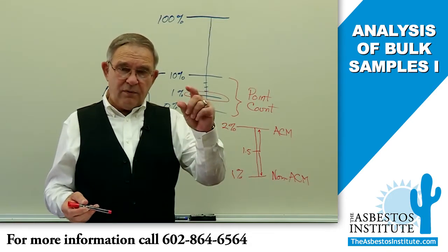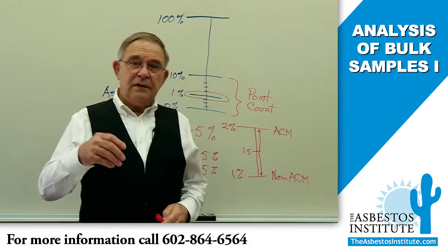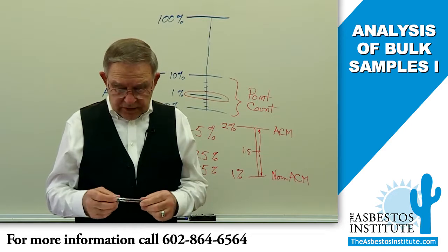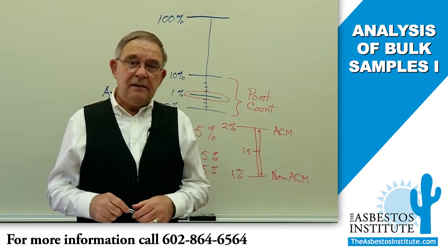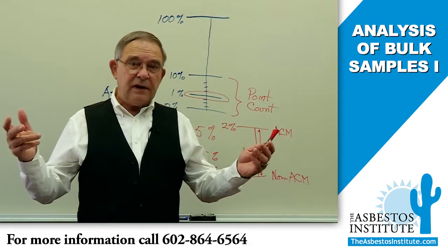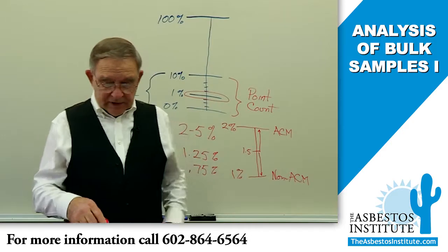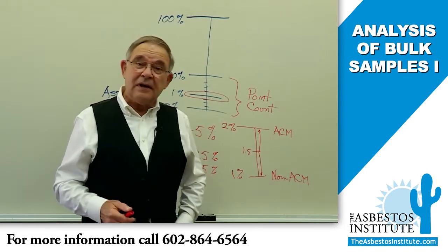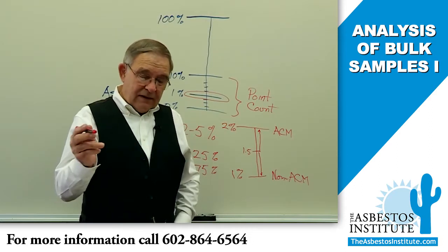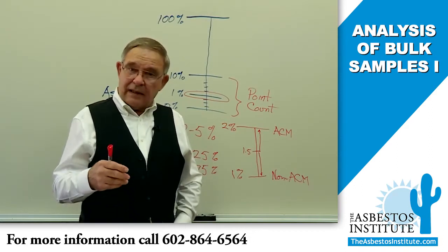So we know where we were weight-wise to start with, what we have left once it's ashed, and then essentially we just dissolve that ash residue in a hot acid, and some of it will dissolve away and some may not. Now whatever is left we weigh again, and it's more complicated than this simple explanation, but essentially that's it. We end up with residue that is not affected by high heat or acid, and we analyze that.